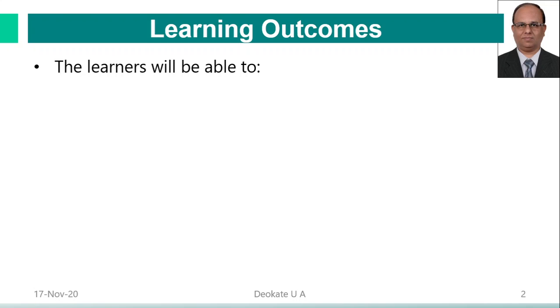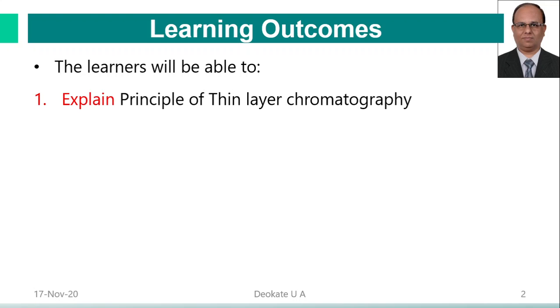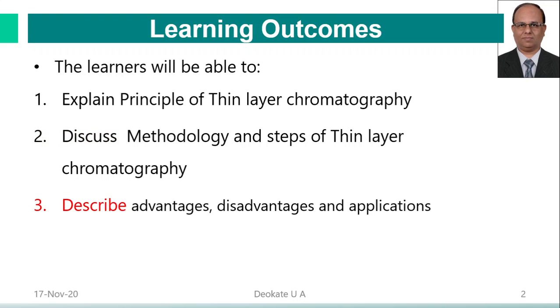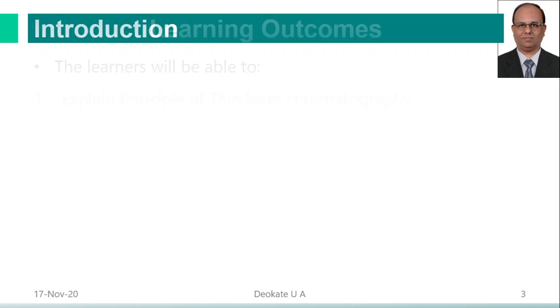The learning outcome. The learner will be able to explain the principle of thin layer chromatography, discuss the method and steps of thin layer chromatography, and describe advantages, disadvantages, and application of thin layer chromatography.